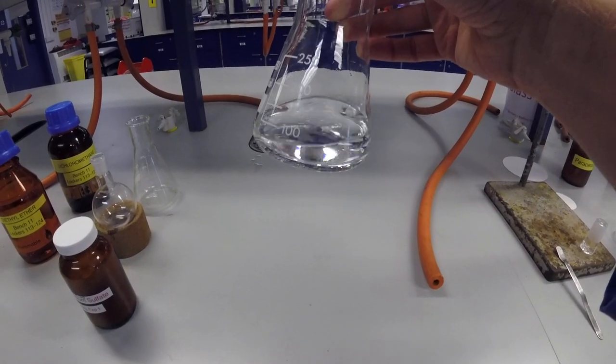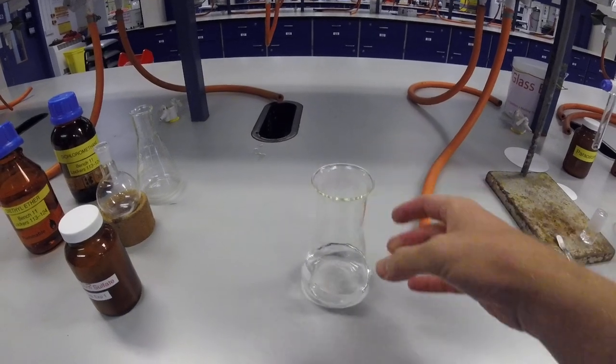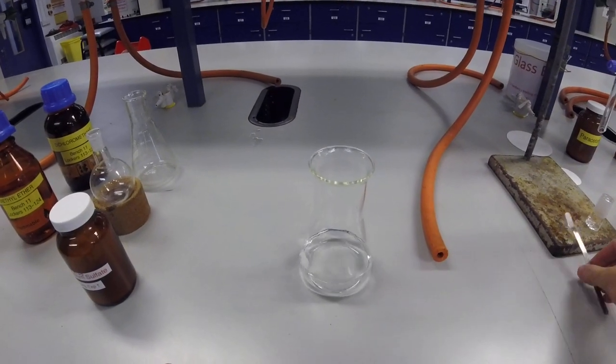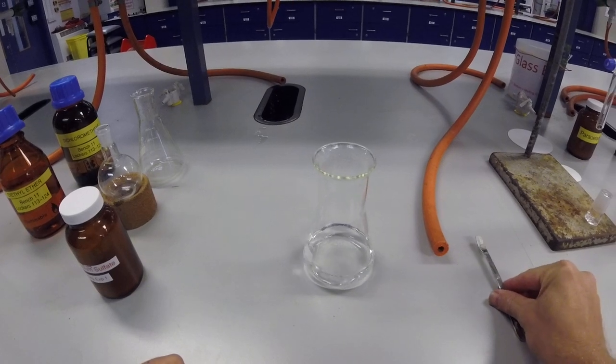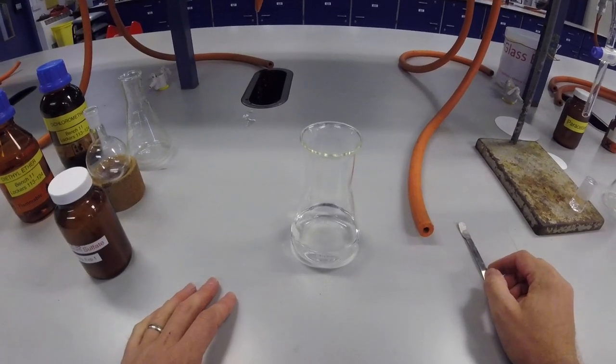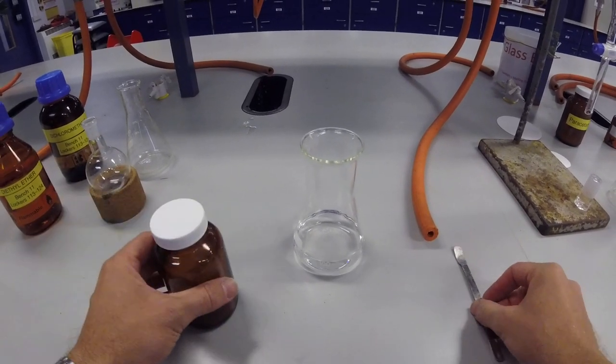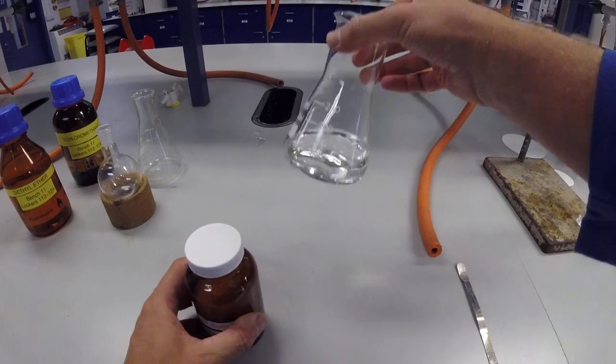Before we can do that, we need to dry the solvent, because the separation itself wasn't particularly very precise at separating out the water from the solvent. And things like ether itself, even though it's immiscible in water, can contain up to 5% water in it. So we want to get rid of that water.